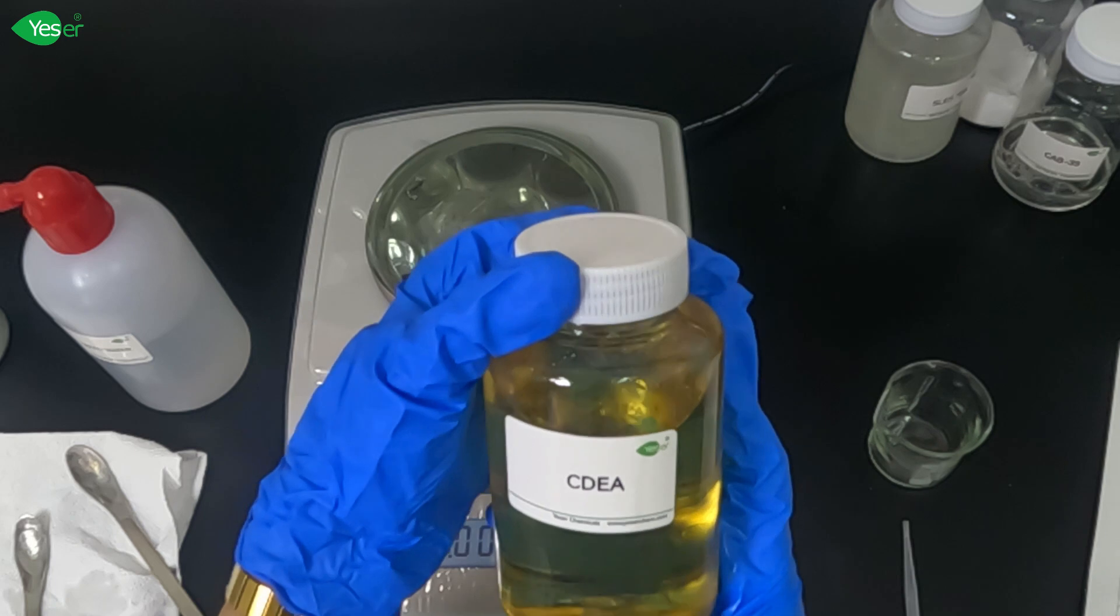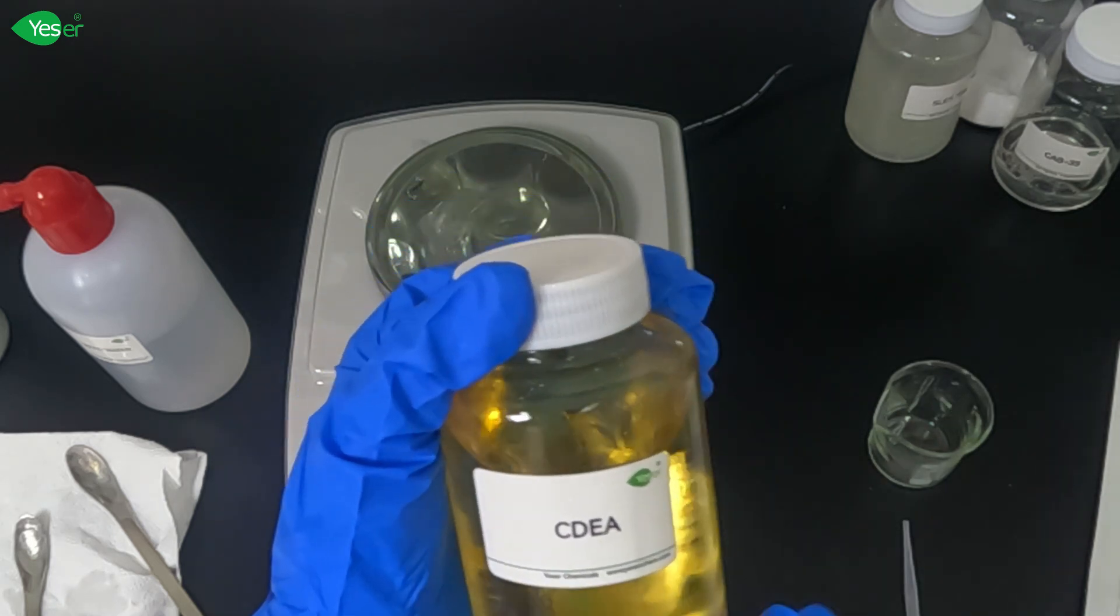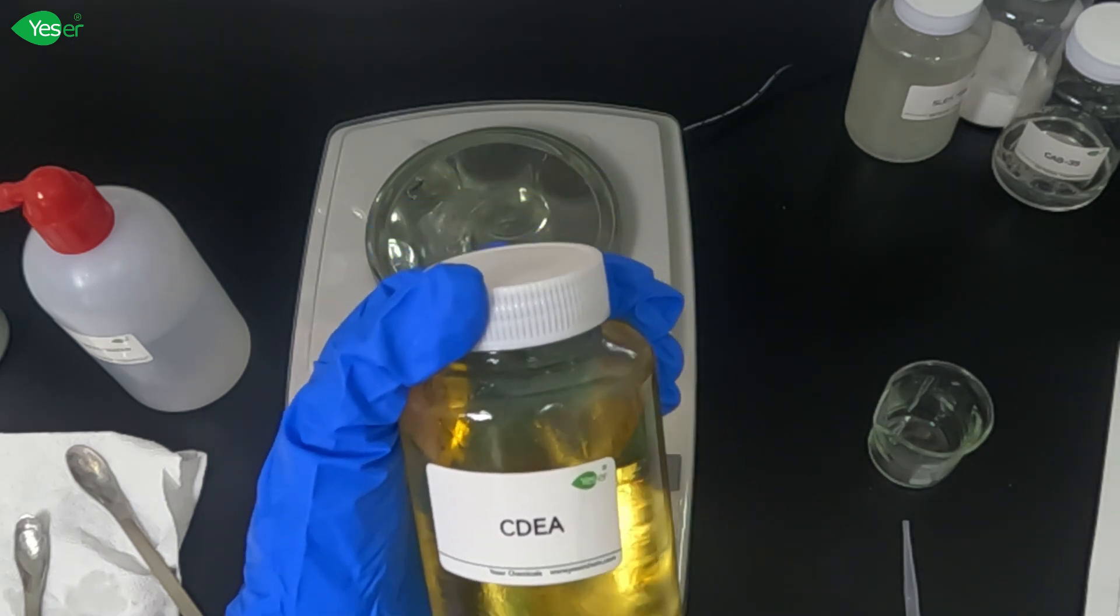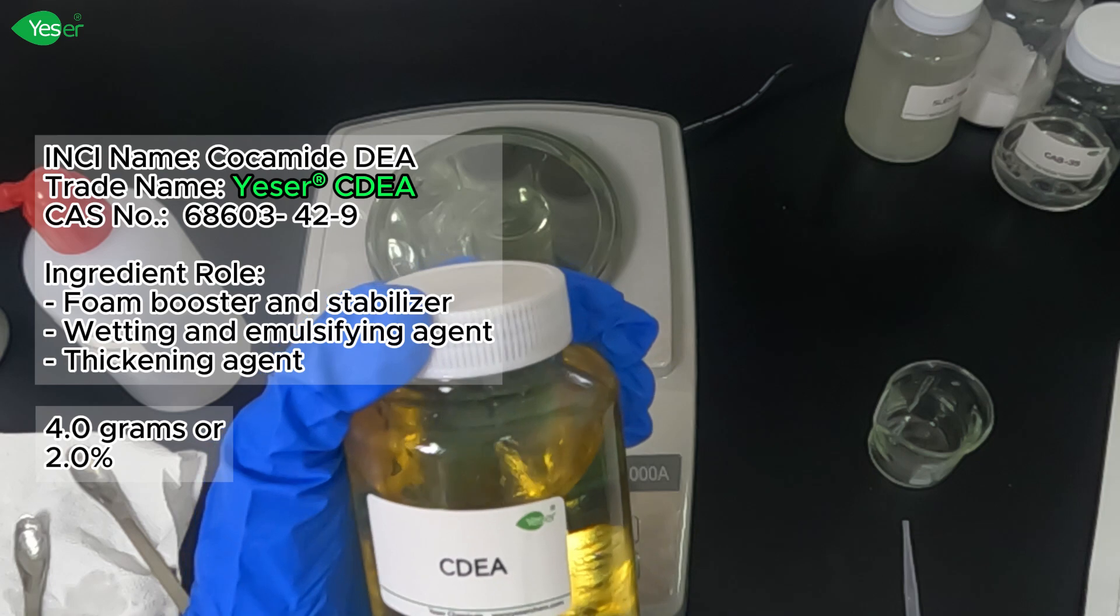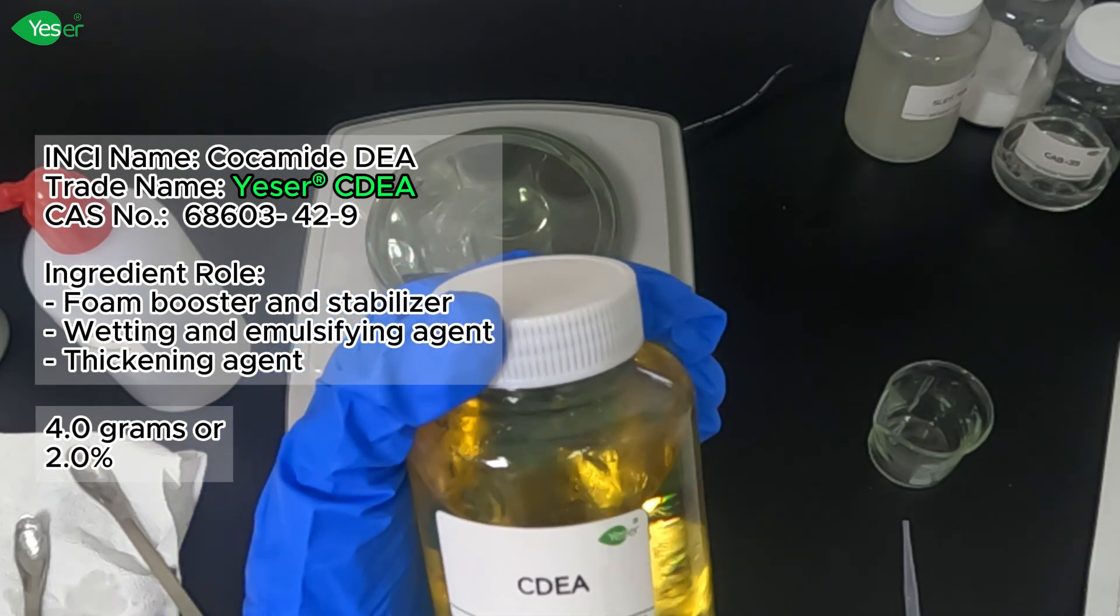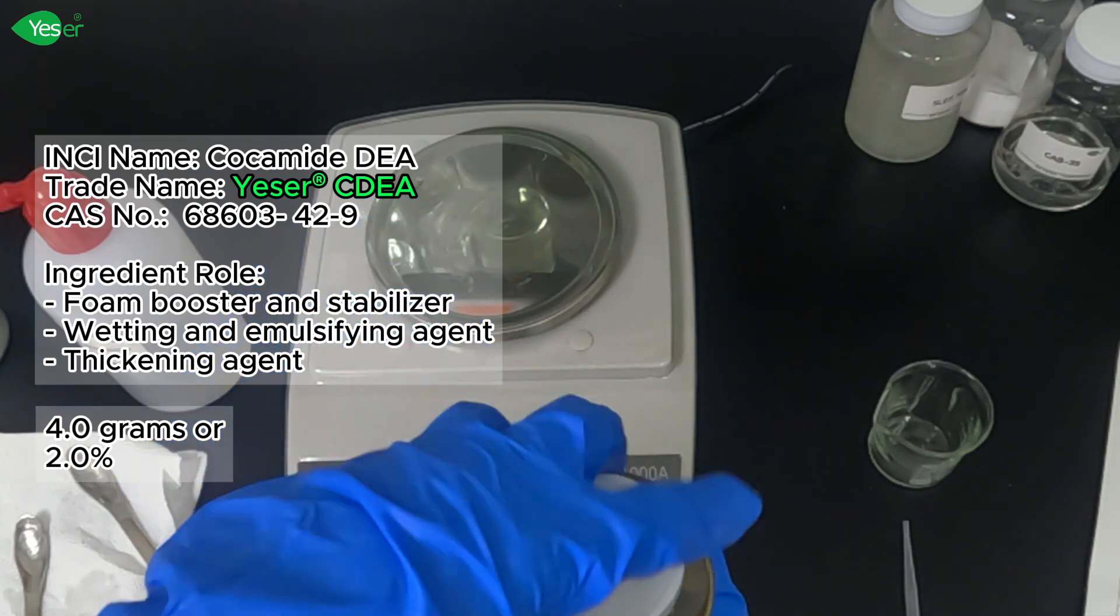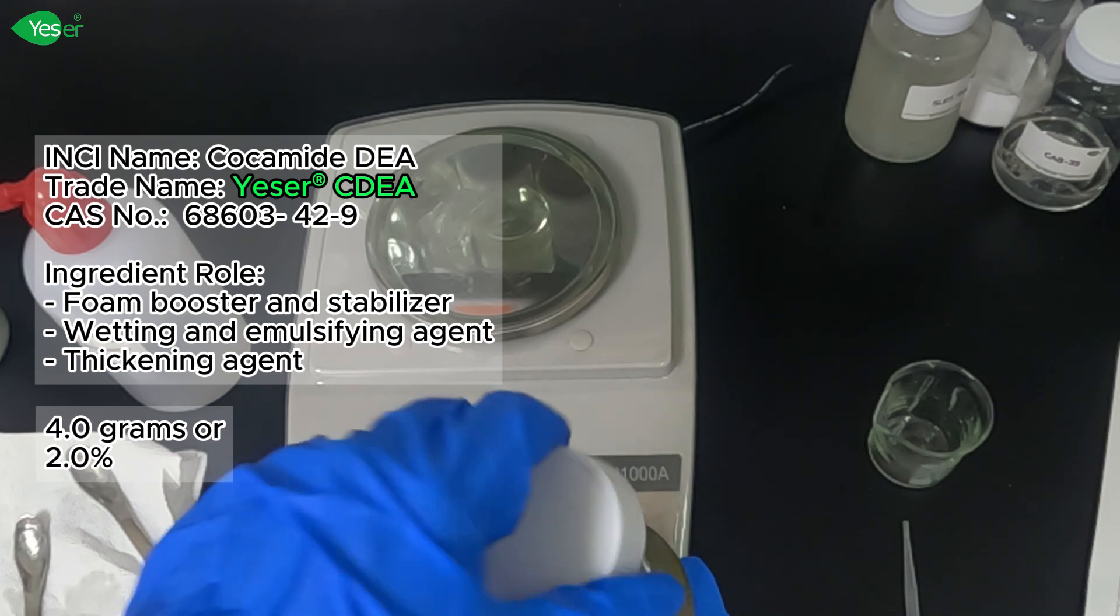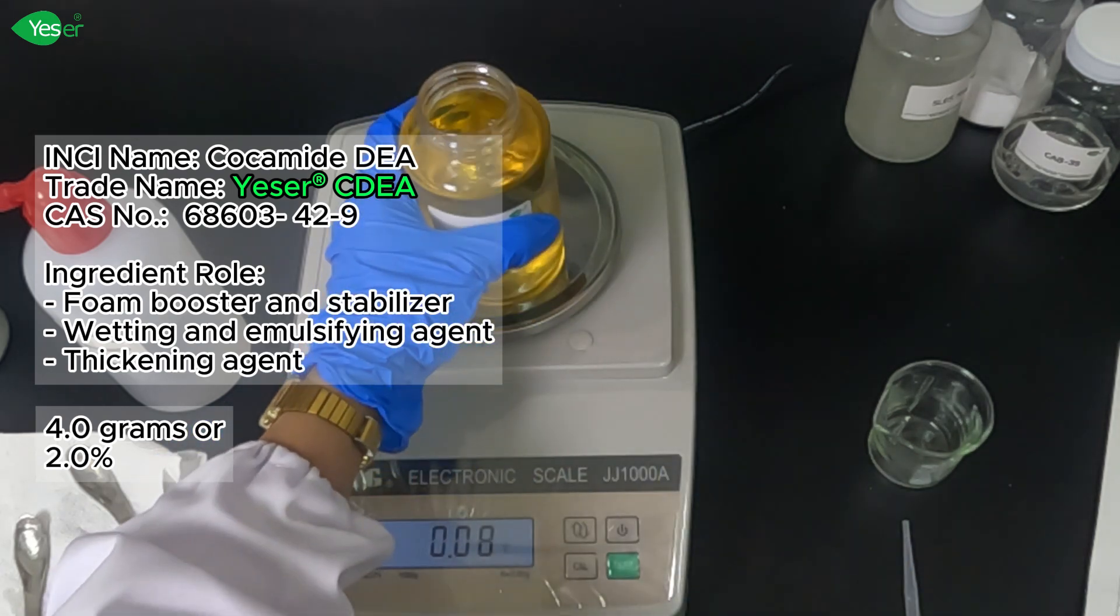Finally, in this phase, we will add CDEA. This is a foam booster and stabilizer. It also helps to thicken the body wash, giving it that luxurious feel that consumers love. We're going to add 4 grams of this, 2% for our formulation.